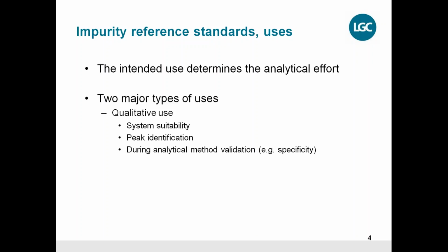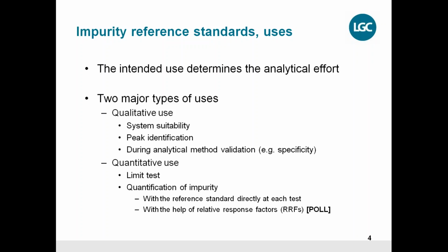We have also, however, the quantitative use, of course, and that is, for example, the limit test and also the quantification of impurities. That you normally do either with the reference standard directly at each test when it is routine testing and quality control, or you have developed a method where you are using the help of relative response factors in order to quantify your impurities.